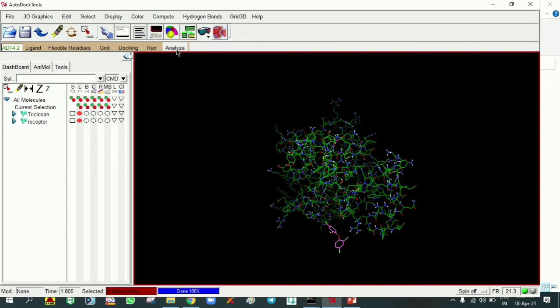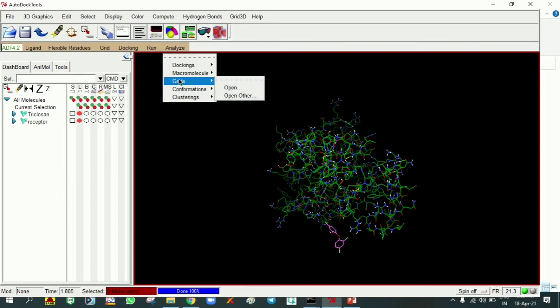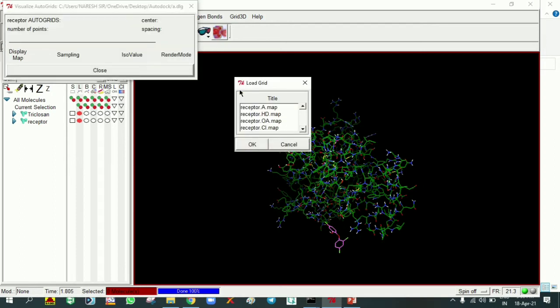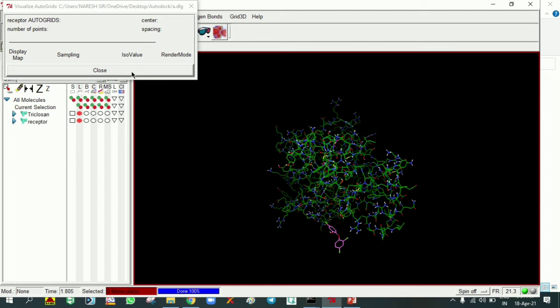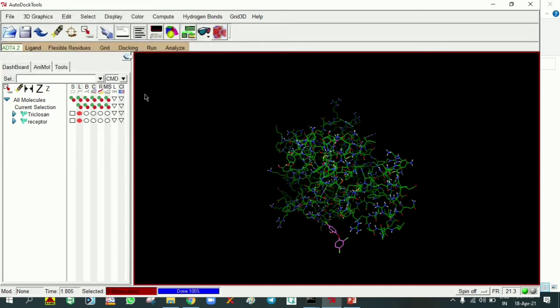Then go to the same Analyze, Grids, Open. The grid files that were generated in the folder are going to open. Click OK and close this one.